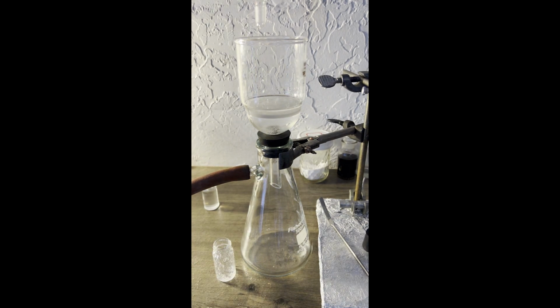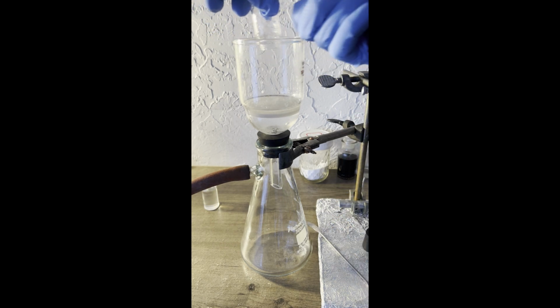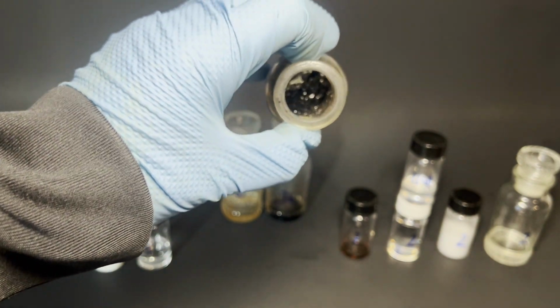The melting points of both PDCB products collected were 54 to 55 degrees, very close to the literature value of 53.5 or 54 degrees. Any MDCB that was produced in the chlorination was also removed by this fractional freezing filtration because it is a liquid at room temperature, and actually at freezer temperatures, but again, it was removed by the filtration. After all that, here is what I got.